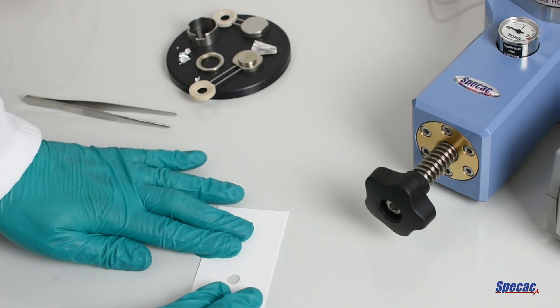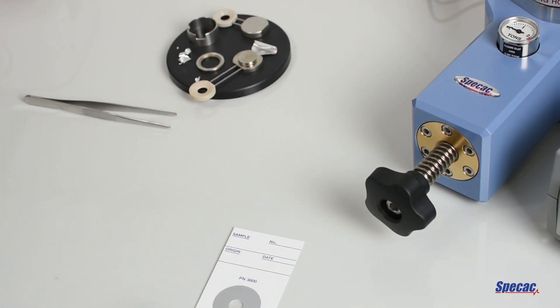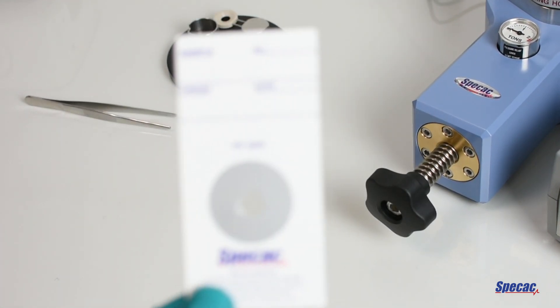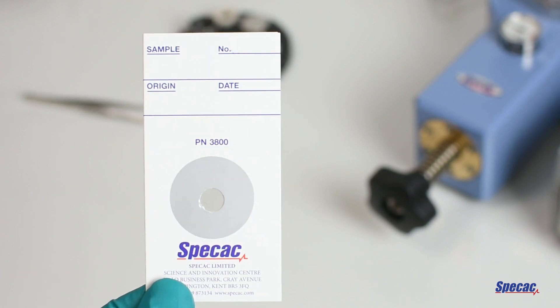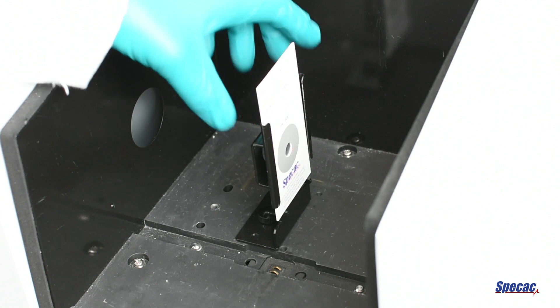The Specicards are 3 inch by 2 inch in size and fit standard spectrometer compartment mounts. A typical infrared transmission spectrum for the polyethylene sample can be obtained as seen.